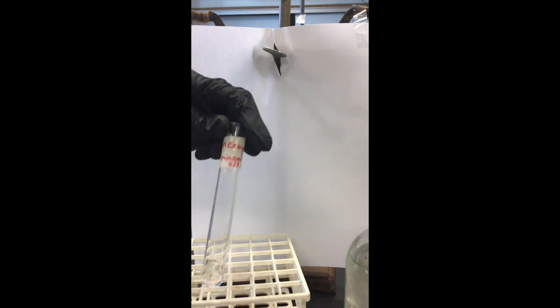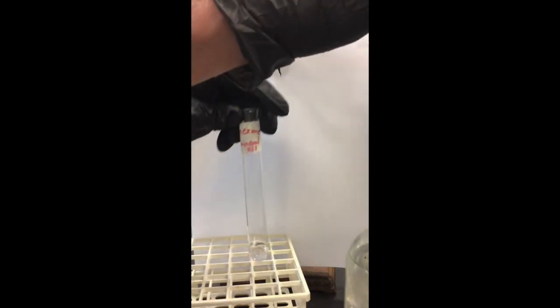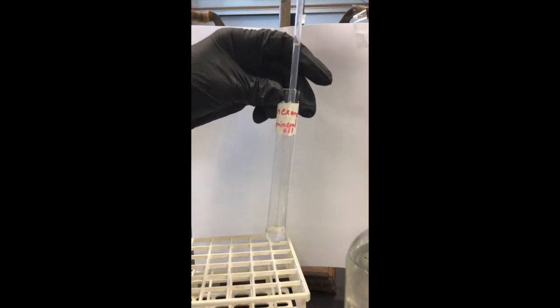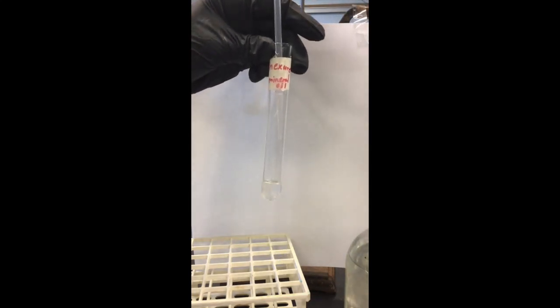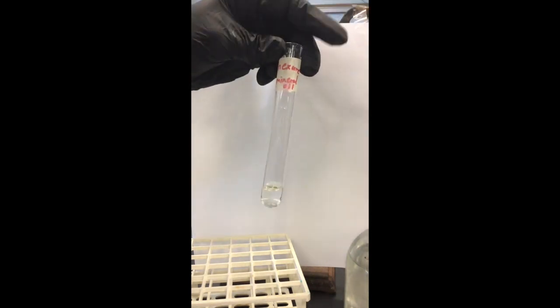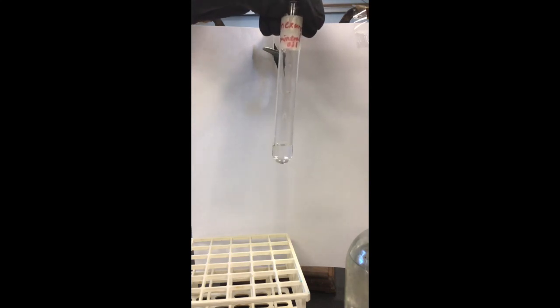And our last sample we have is hexane and mineral oil.